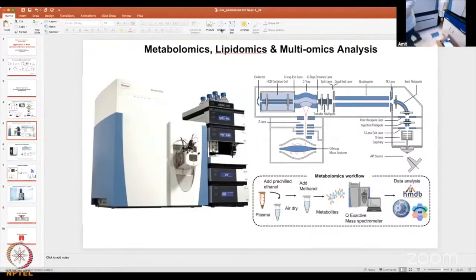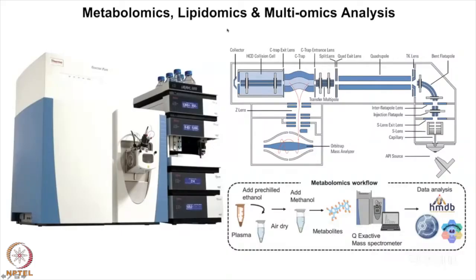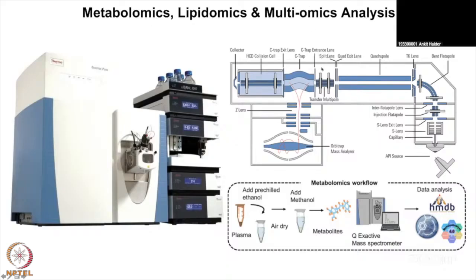All right, thank you, Ankit. It was a good overview of the Orbitrap Fusion. Again, mass specs can be utilized for different types of omics-based investigation, not only proteomics but also metabolomics or lipidomics. So one can utilize the power of these instruments for multi-omics investigation, and even from the same sample, you can think about doing multiple layers of the sample.